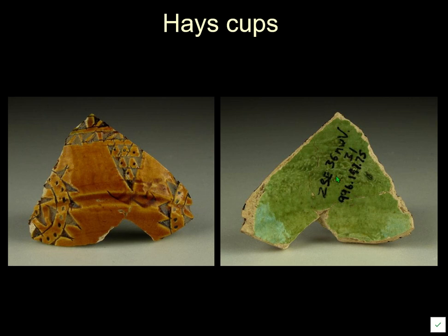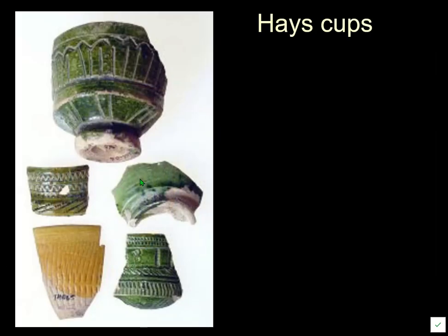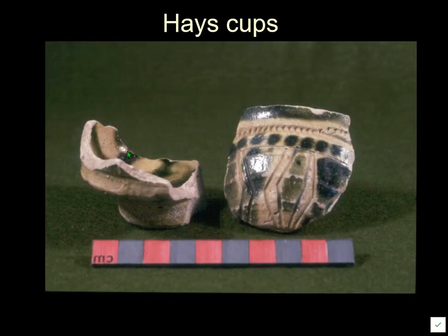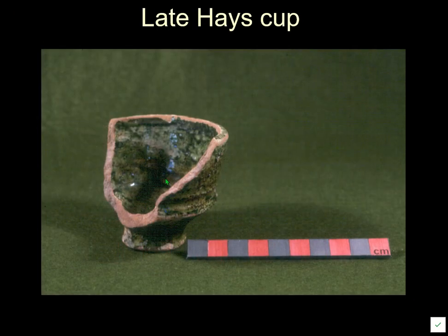Here's some very nice early, probably 16th century ones, and they carried on making them up until recent times. Judging by the appearance, this is quite a recent one, and this is the quality of pottery that they're actually still making in Heis until recent times.